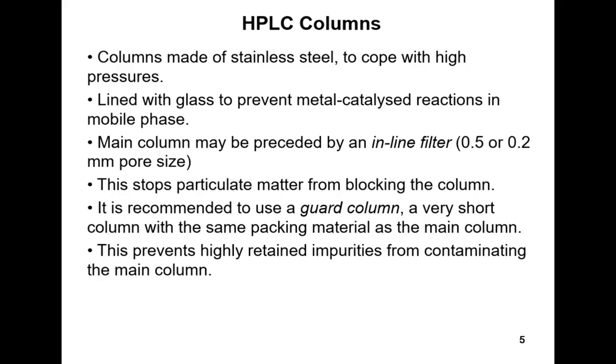If you like mechanical things and tools and so on, they're quite nice objects in themselves, nice solid, shiny things. The stainless steel is essential because of the high pressures that build up during the HPLC process, so it needs to be very mechanically strong.